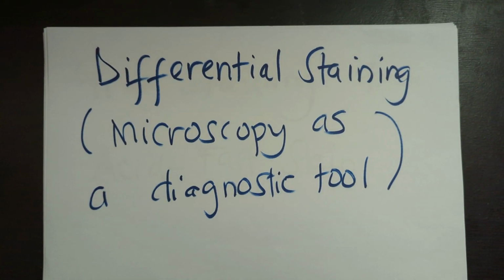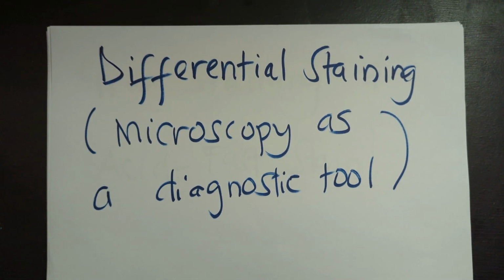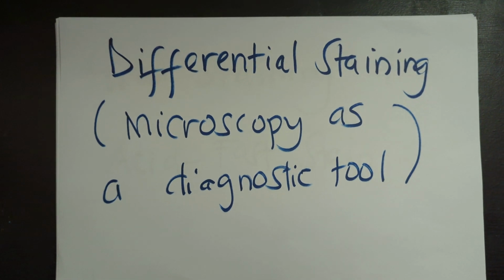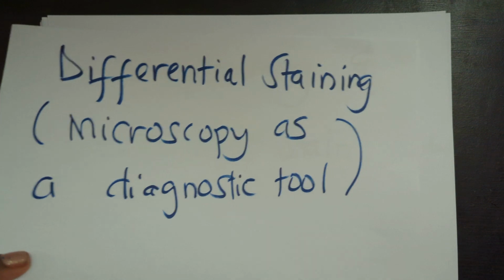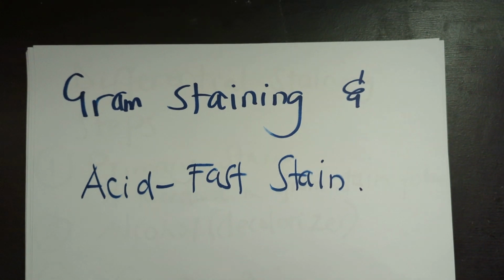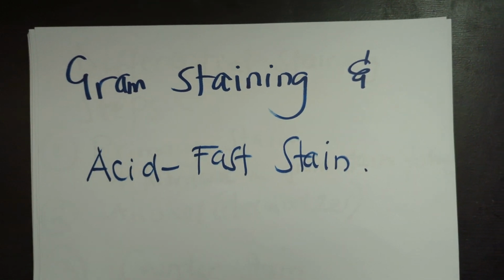And so this is a bit of a tweak, so to speak, because I wanted to cover both differential stainings, which is gram staining and Zn stain, acid fast staining. So just take note of that, please. You do not have the gram stain in the main lab menu, but I hope you have the leaflet with acid fast stain notes.